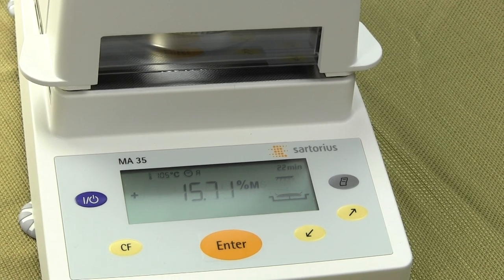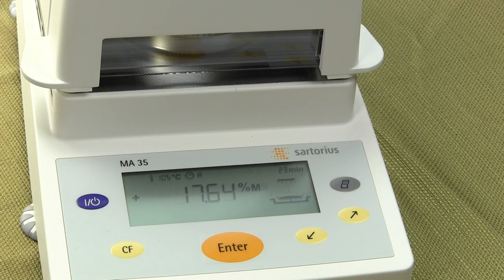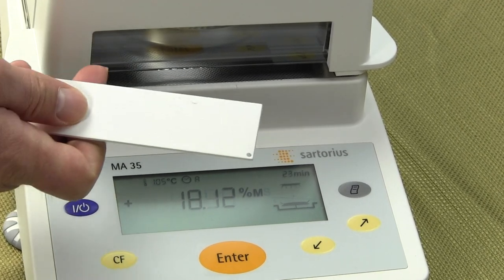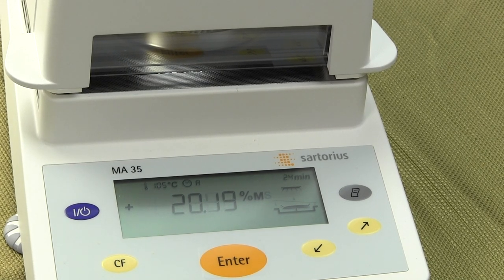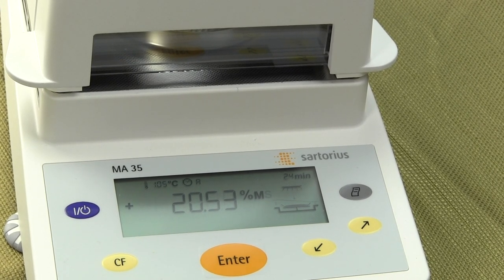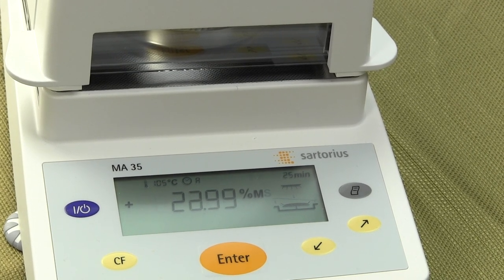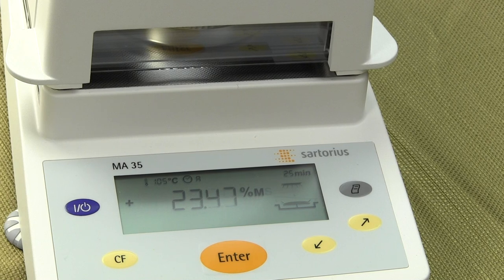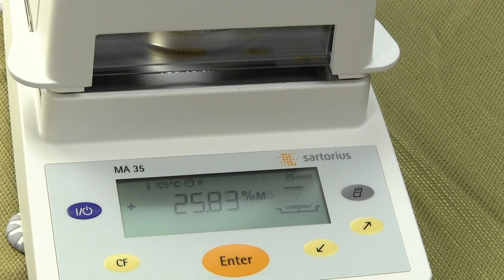We recommend going with metal tubular or ceramics since you don't overshoot and burn the item you're trying to determine the percent moisture of. We've already spoken about the difference between the two units — this unit has glass in the front versus the FDA version, which is FDA and HACCP compliant for food processing plants where glass is prohibited.